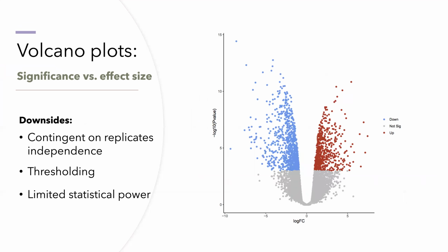Having reviewed some of the assumptions that go into estimating p-values and challenges in both data and analytics, you can perhaps appreciate the degree of uncertainty inherent in most p-values reported in various forms, including on volcano plots. In particular, the degree of dependence or independence in the data points very much influences the estimated p-value, and that makes it very challenging to rely upon it.